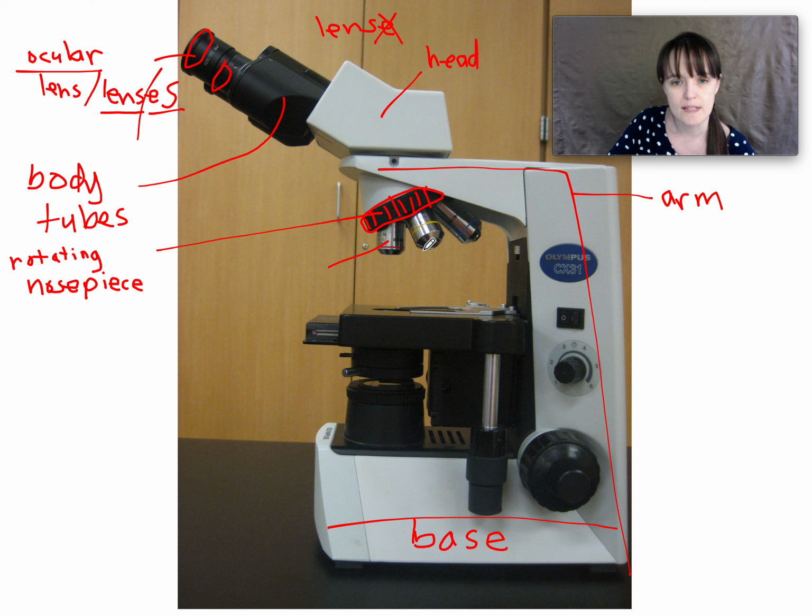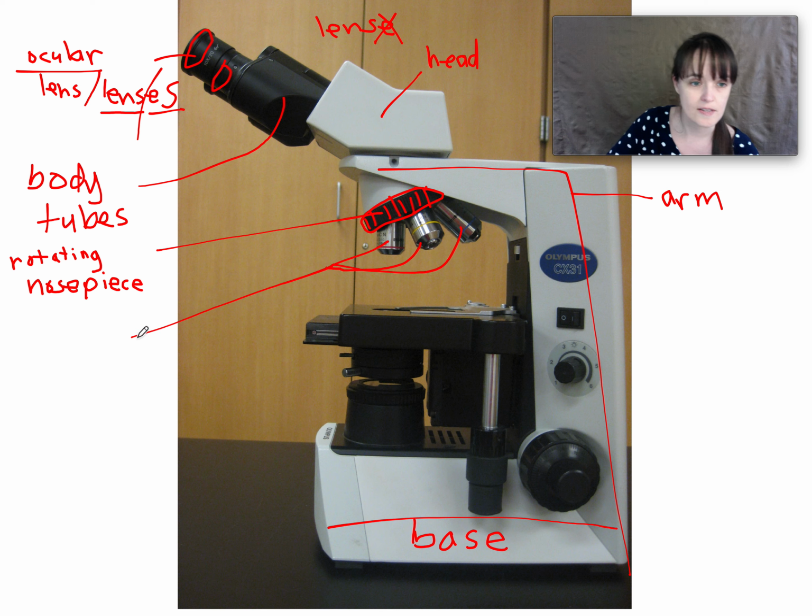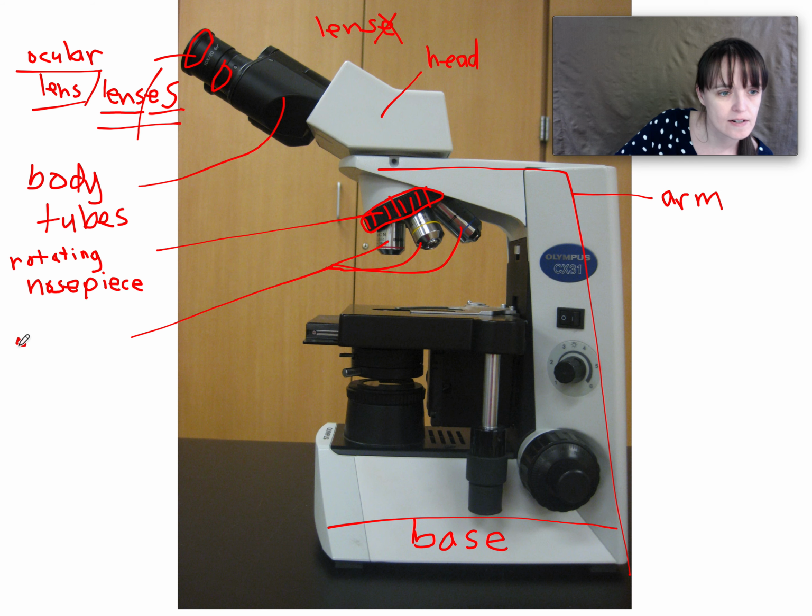And from the rotating nose piece are the objective lenses. And again, one lens or two lenses. Actually, there's three, but anyway, there's no E on the end of lens. And these are objective. They magnify. The ocular lenses magnify by 10, as you can see here, 10 times.